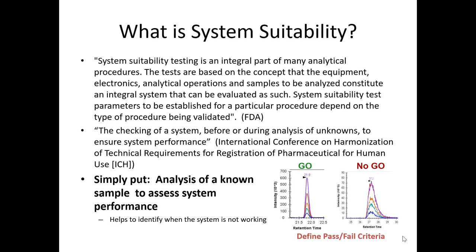So what is system suitability? It's an integral part of testing all of the bits and pieces of the system, the hardware, even the software to some extent. And it allows you to check the system performance at any point in a very longitudinal way with different users.